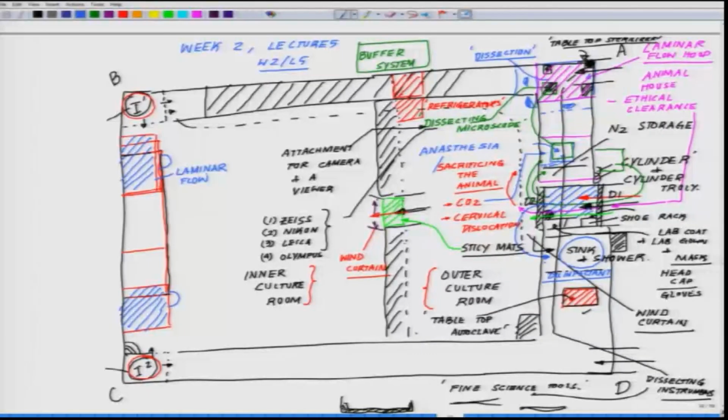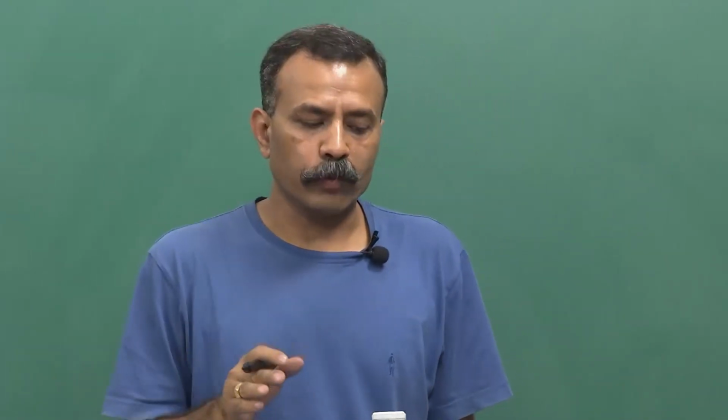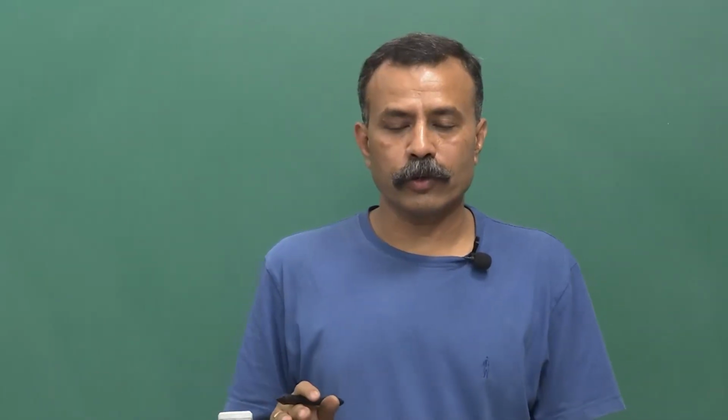So again, if you noticed one interesting aspect, if I have to put one single line like this, this is your entry and cross. So of course there's a wall here, assuming there's a wall or a glass or something, so there's a blockage here. It's not really moving, but I'm not putting any of the major piece of instrument which will come on the way of the air current. Try to avoid this as much as you can. Do not prefer to keep anything which is coming on the way. It's very widely advised that you minimize that, somehow or other, as much as you can.